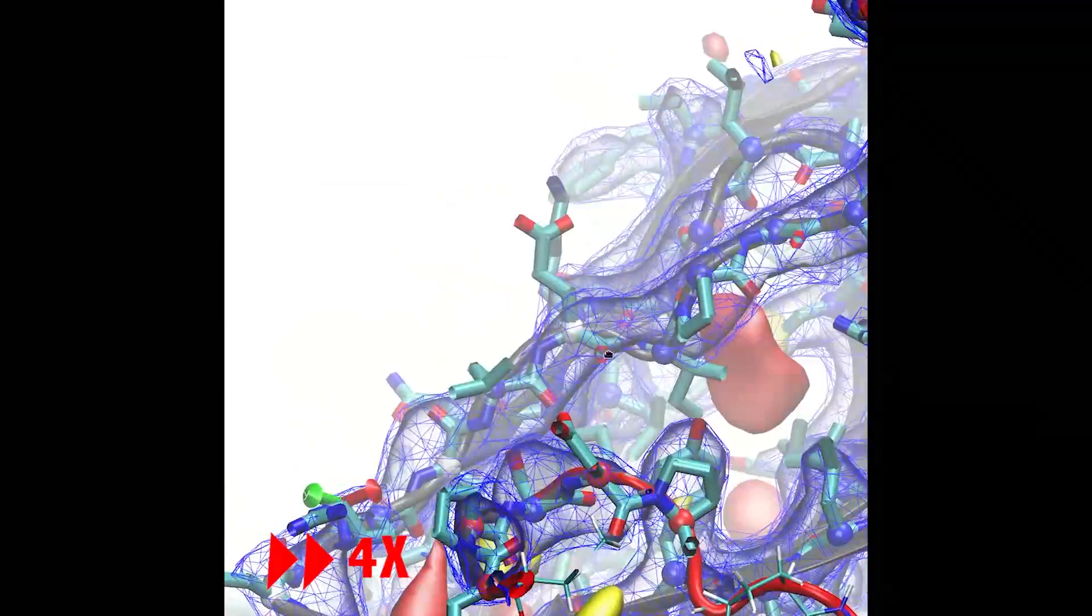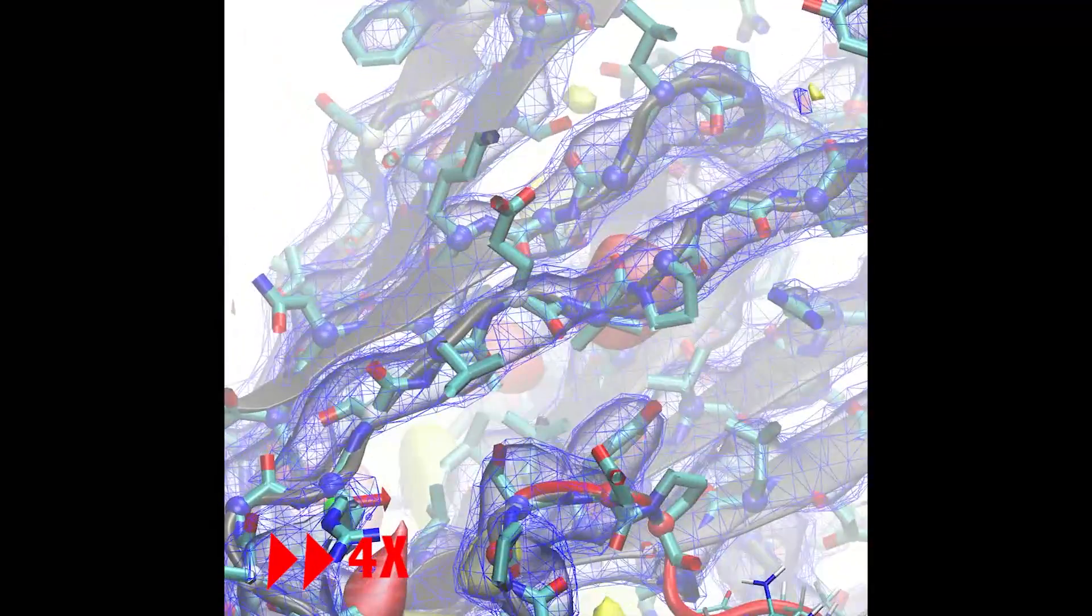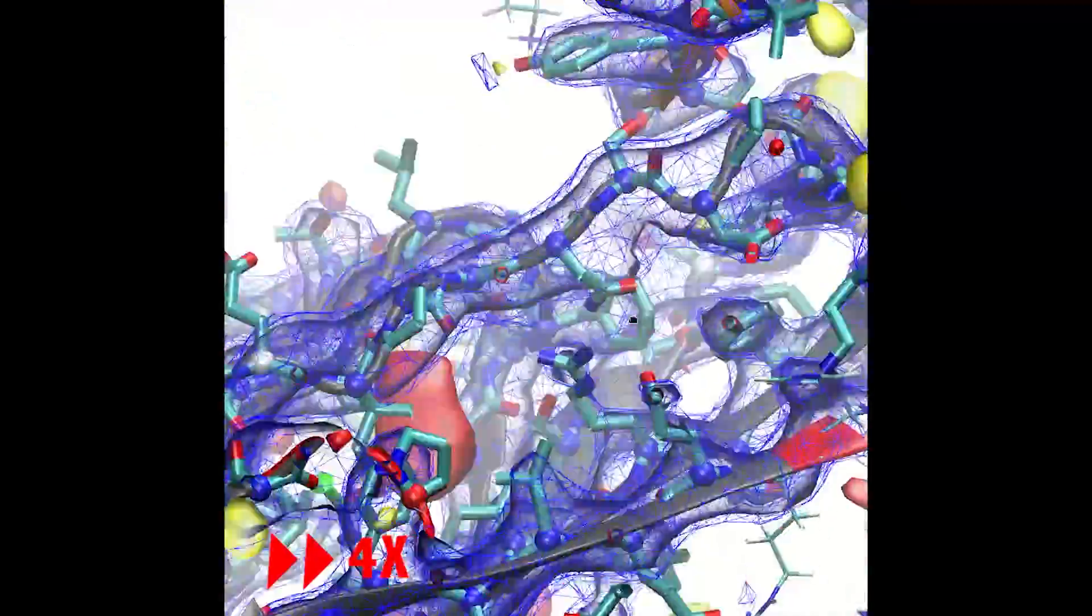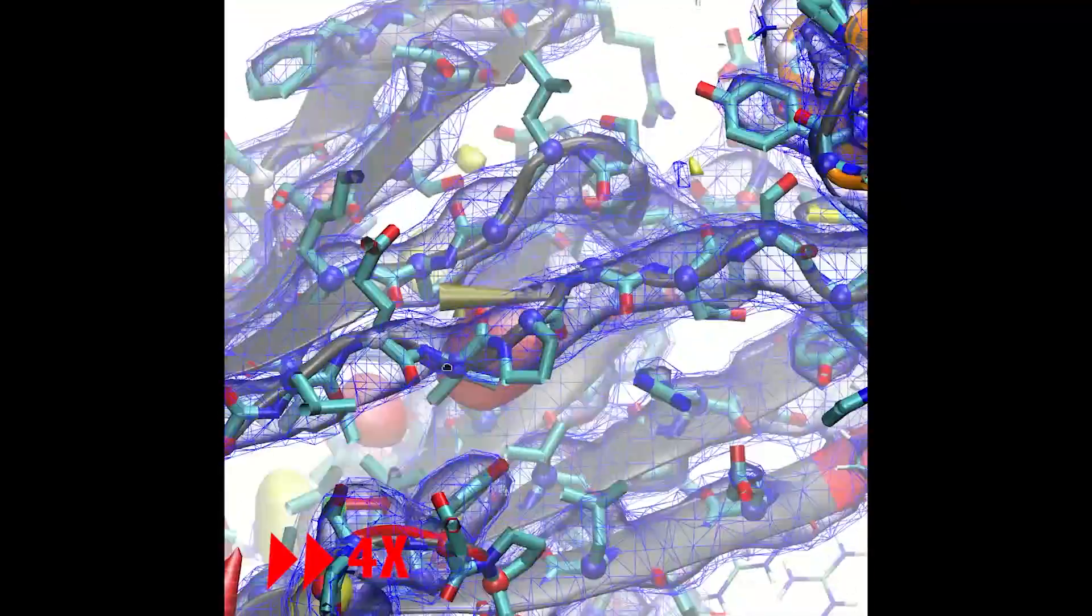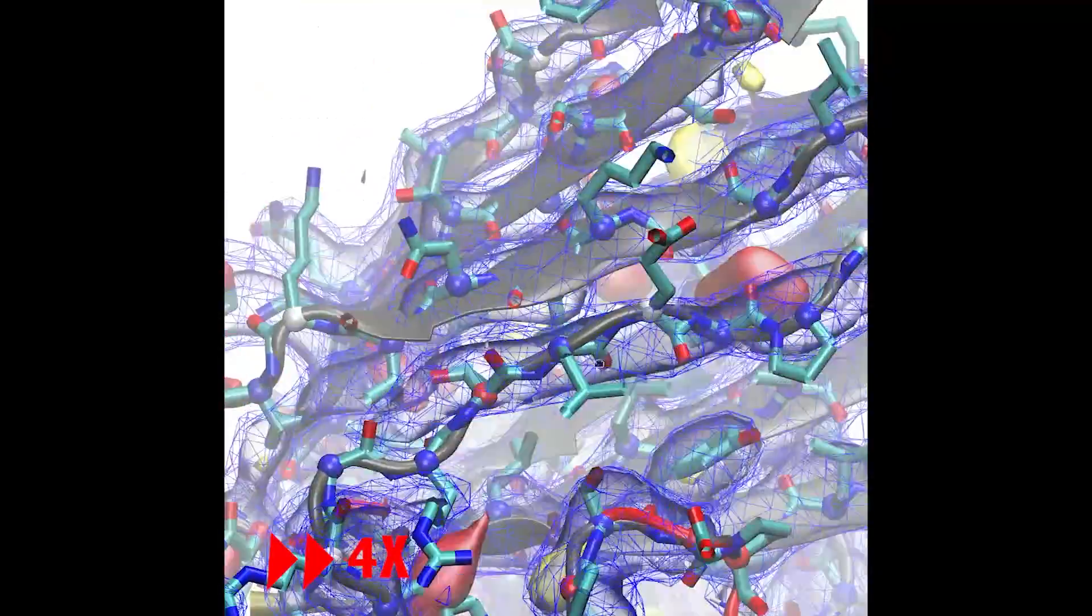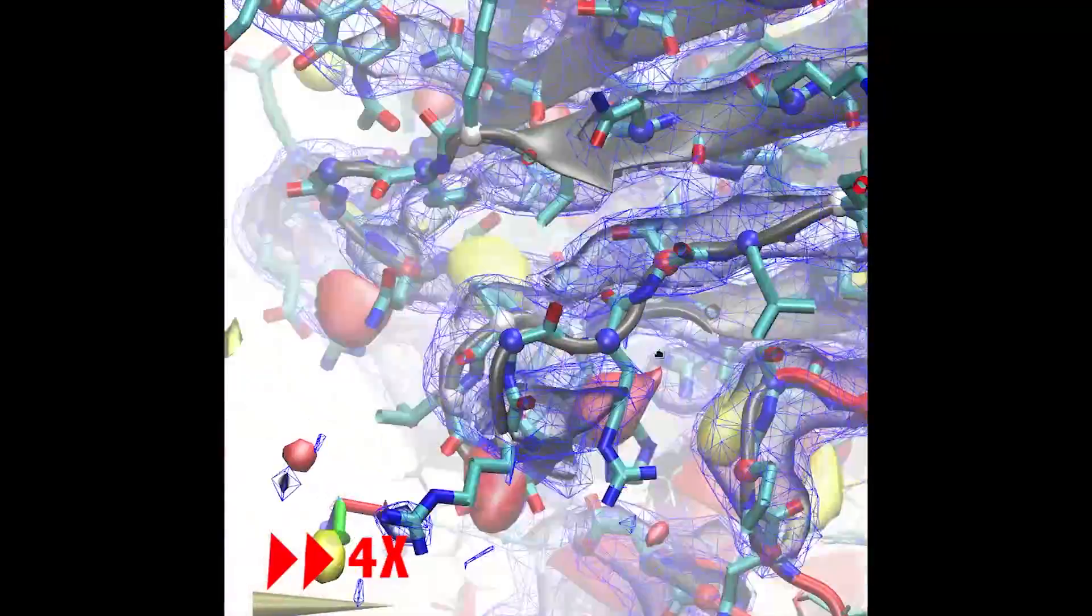The remainder of this video tracks the remodelling of this and the remaining two out-of-register beta strands. While I have accelerated and trimmed the playback, the real-world time for inspection and interactive remodelling of these four strands was a little over 30 minutes.